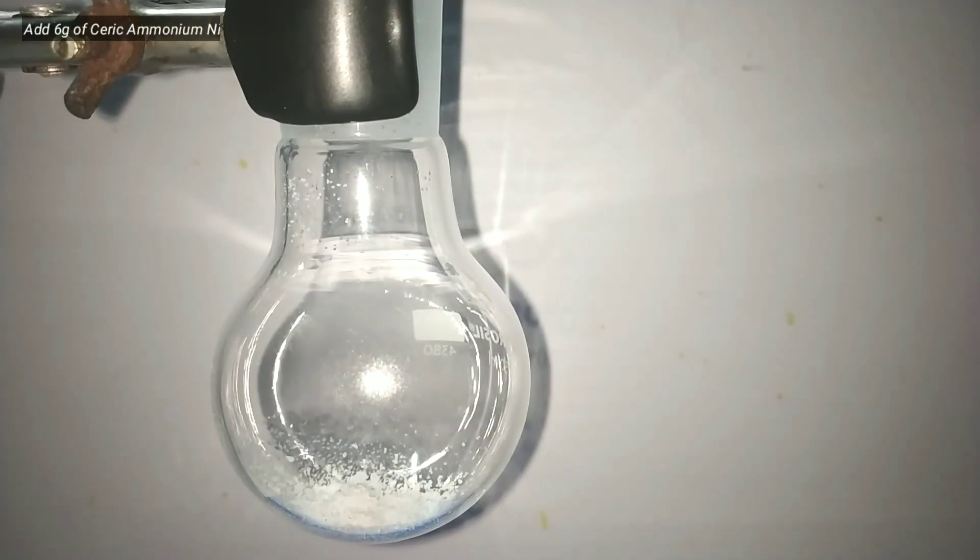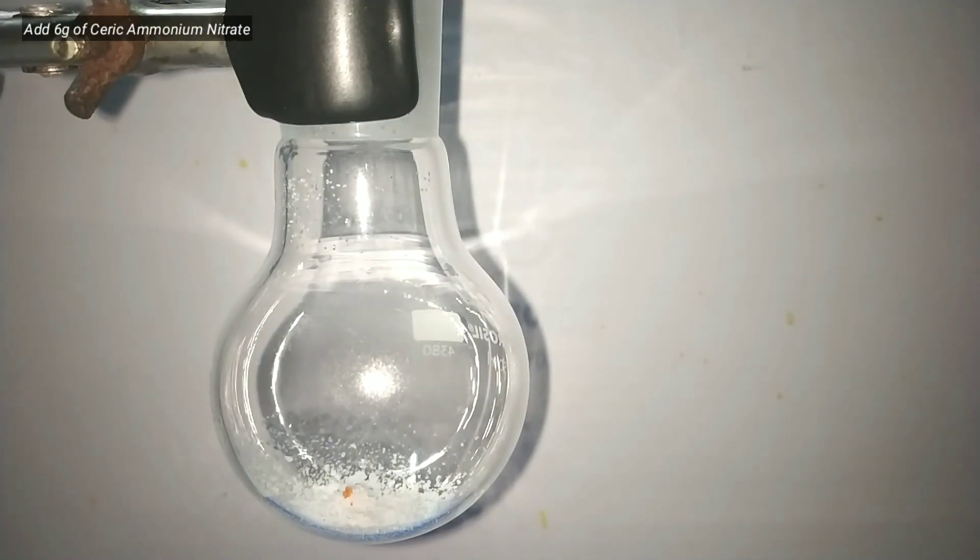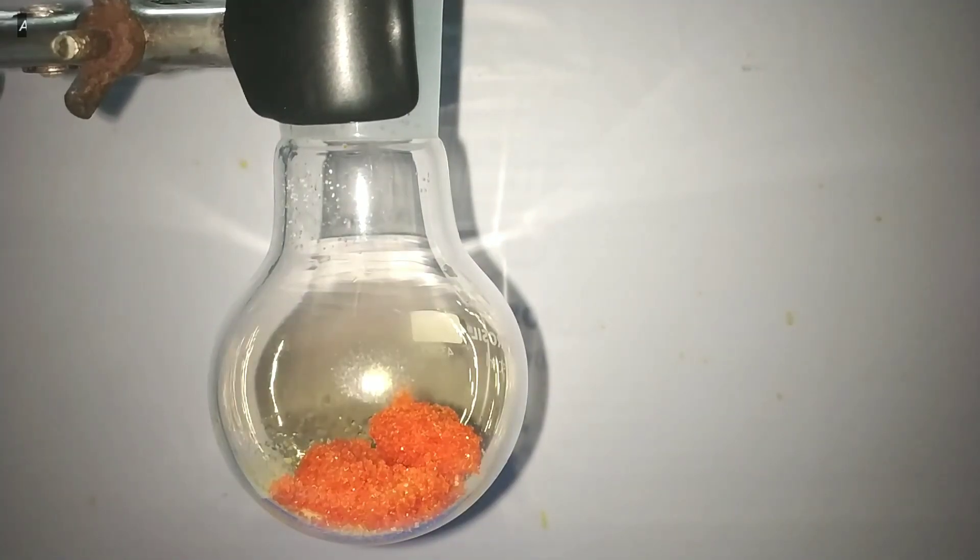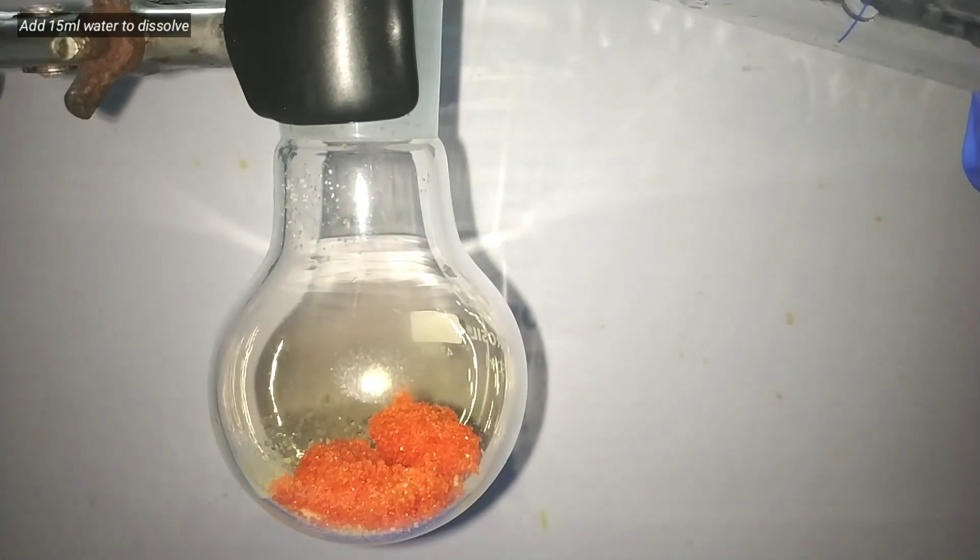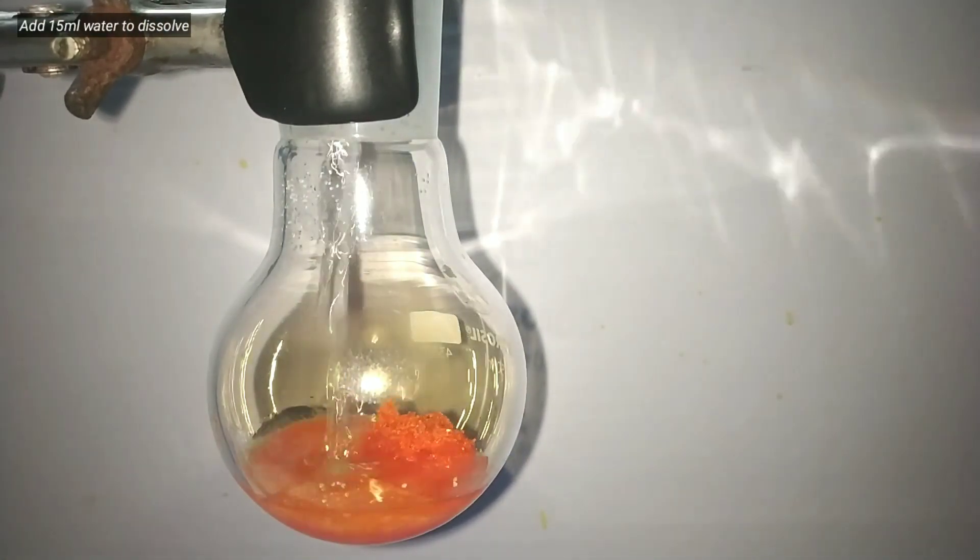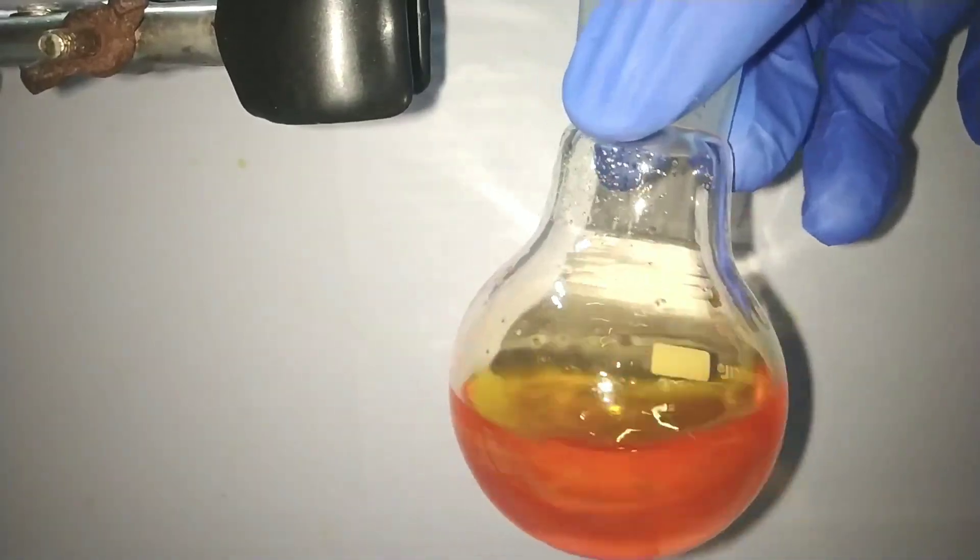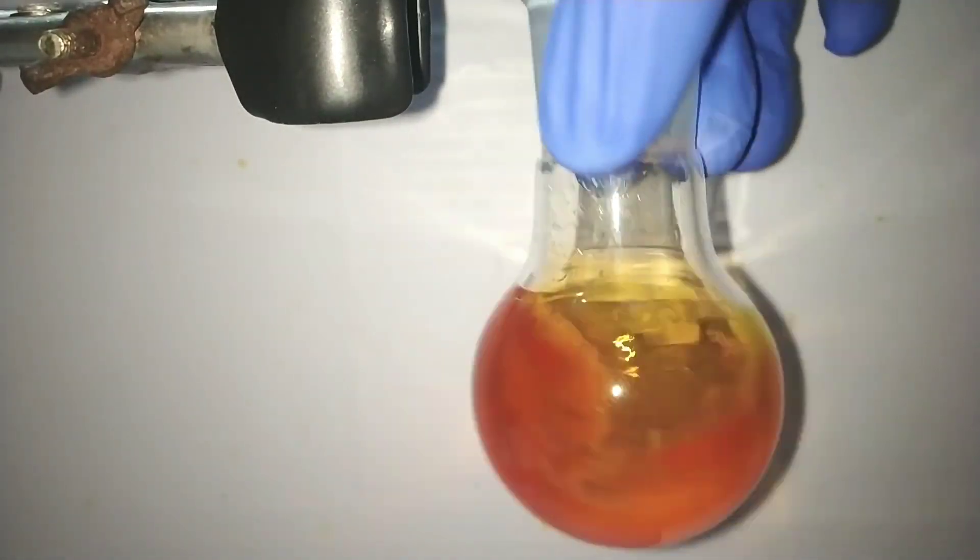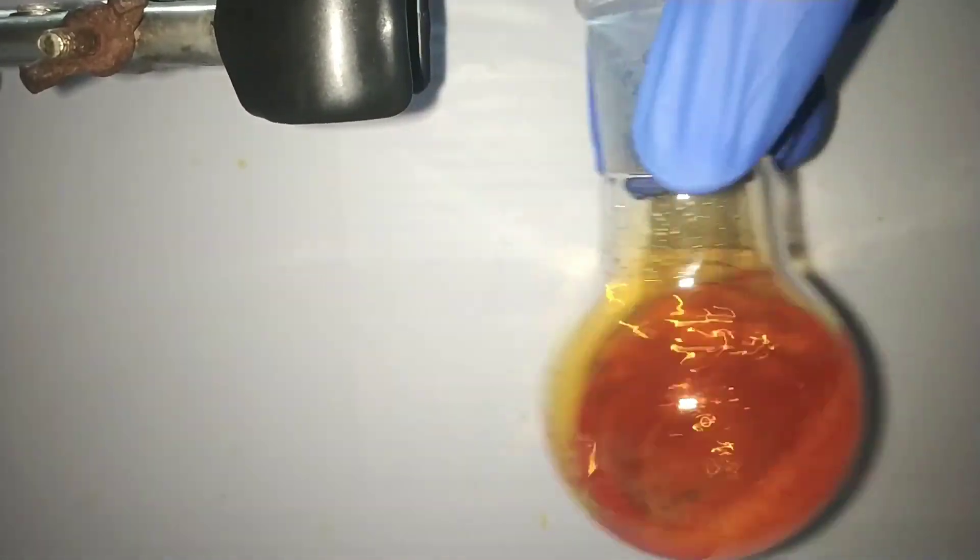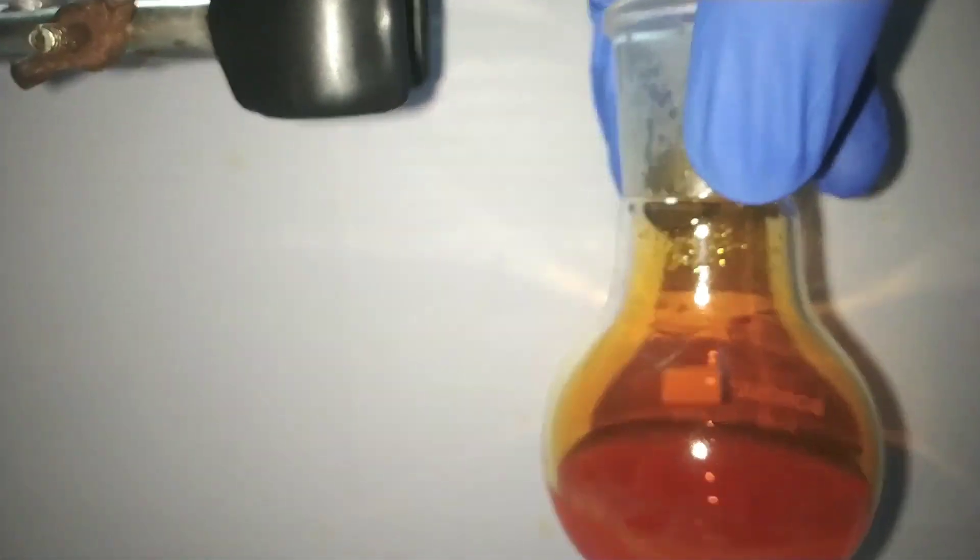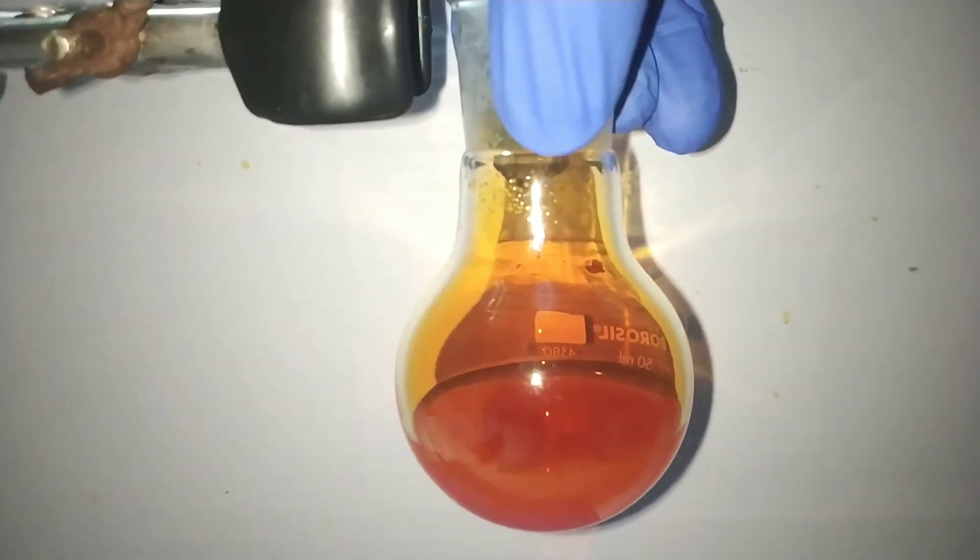Next we add 6 grams of ceric ammonium nitrate into it. It has a bright orange color and looks exactly like potassium dichromate crystals. Ceric ammonium nitrate is a pretty strong oxidizing agent which oxidizes the bromide and generates the bromonium ion or bromine in situ which then reacts with the acetanilide to form the final product. Ceric ammonium nitrate and potassium bromide is our novel brominating agent.